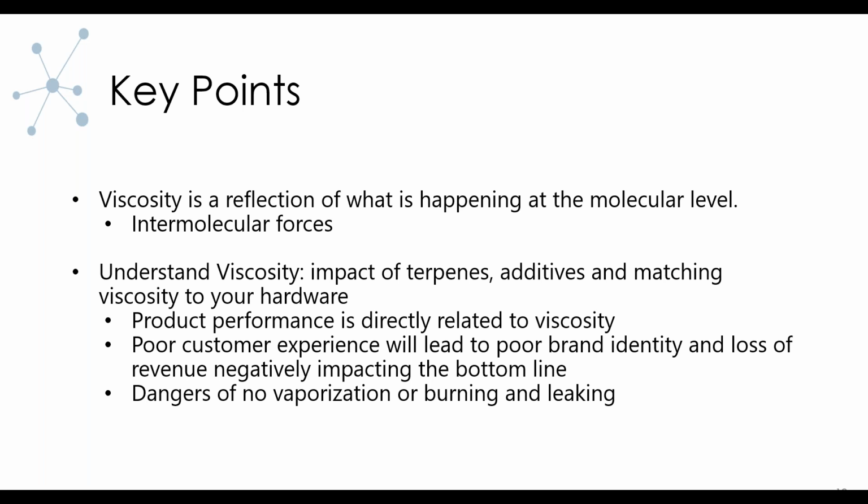And finally, I'd like to go over the key points of my talk. Viscosity is a reflection of what is happening at the molecular level. It gives you insight as to what is happening with the molecules as they interact with each other. Understanding viscosity is really important if you are adding terpenes to your distillates, because that will change the viscosity greatly. It's also very important to understand viscosity and match that to your hardware.